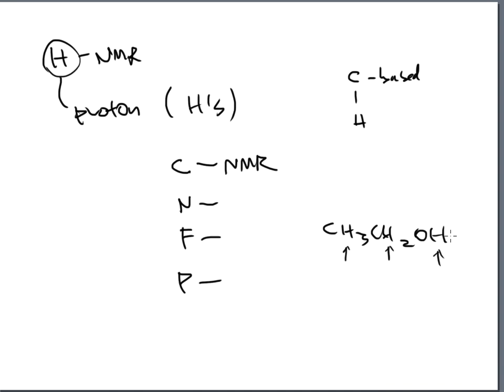Well, someone along the course of the way said, now wait a minute, there's hydrogens here and hydrogens there and hydrogens there. There's hydrogens all over the place. So why don't we simplify this down a little bit, and why don't we focus on just carbons? Because if we focus on carbons, you're going to get an idea of the molecule. Maybe not exactly everything, but you're going to get a good enough idea of the molecule on how it's structured.